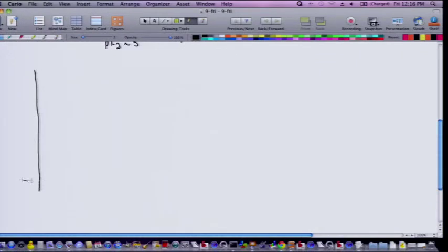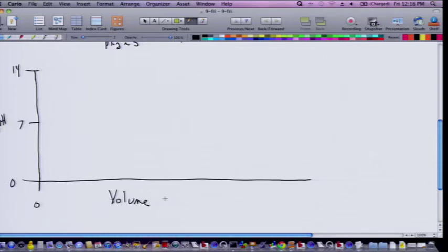And as I said on the top of the slide, we're going to do a titration as you perform in the laboratory, if you haven't done so already this week. You're recording pH on the y-axis, and on the x-axis you're titrating a volume of acid. So you say on the x-axis volume of acid added or titrated. You can say titrated here if you want. And that's usually in units of milliliters. Your apparatus counts drops and then converts that to milliliters because you did a calibration.